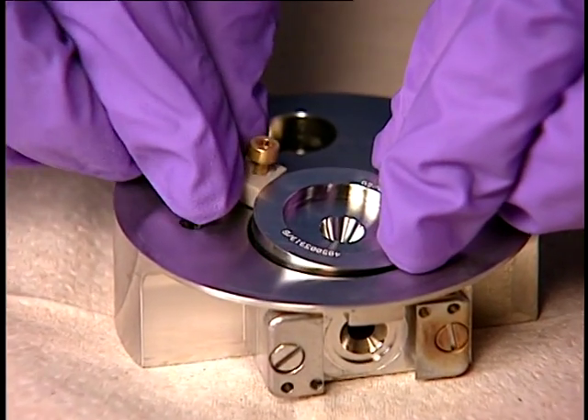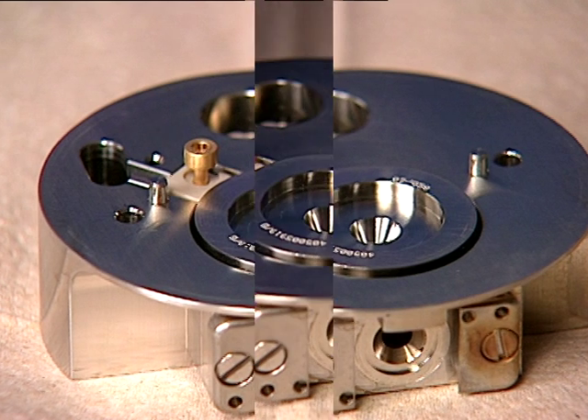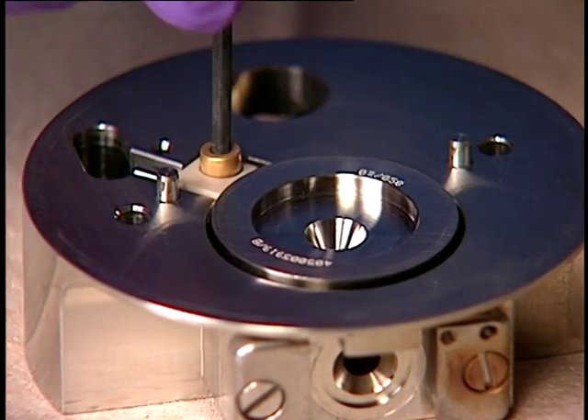Be careful not to damage the extraction cone aperture when inserting the extraction cone retainer and extraction cone into the ion block. Use a 2.5 mm Allen wrench to tighten the captive extraction cone retainer screw.